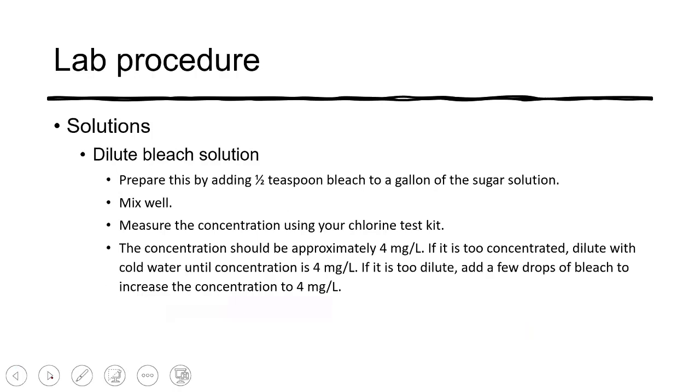The dilute bleach solution should be made on the day that you're actually doing the experiment.